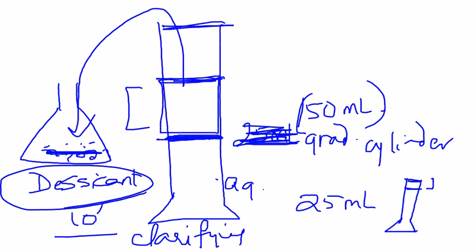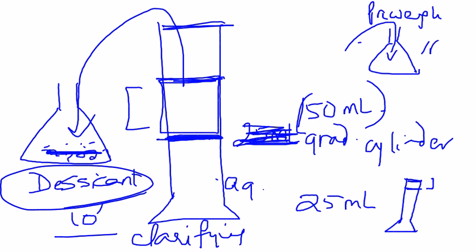And so at that point of time, you will be ready to transfer it into a pre-weighed flask or a beaker. So pre-weigh your flask, transfer it into that, and get your IR, get your mass for the percent yield, get your eta. Your eta is going to be really significant because the eta of the starting material, which is the alcohol, and the ester are really close. And so your final two digits are going to tell me how good you are with the eta.